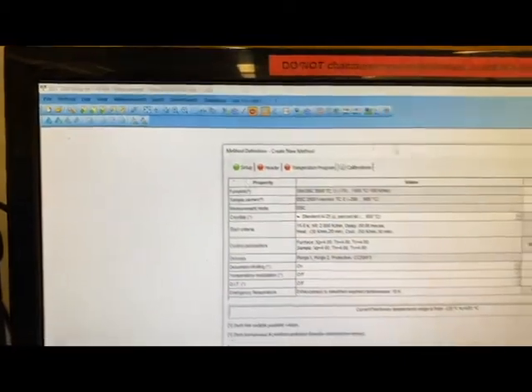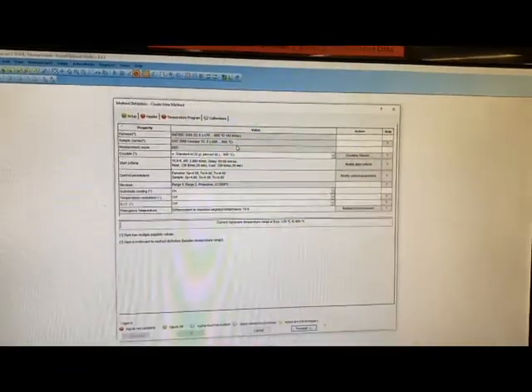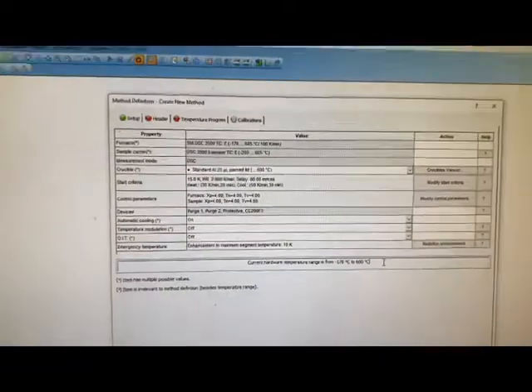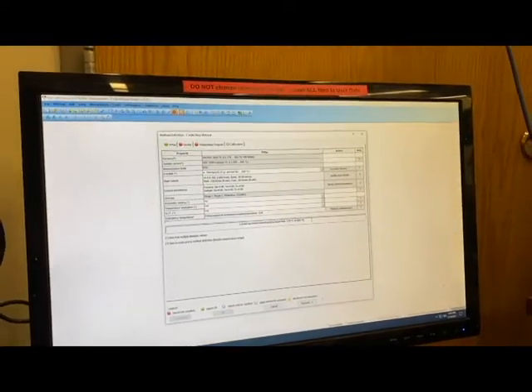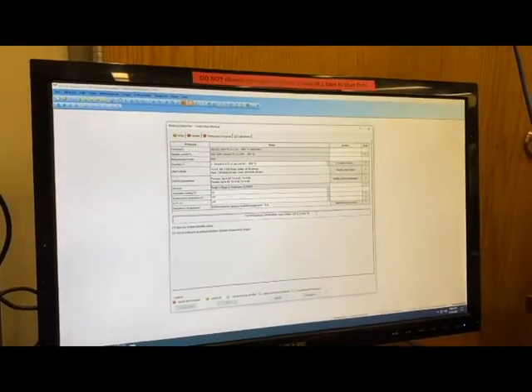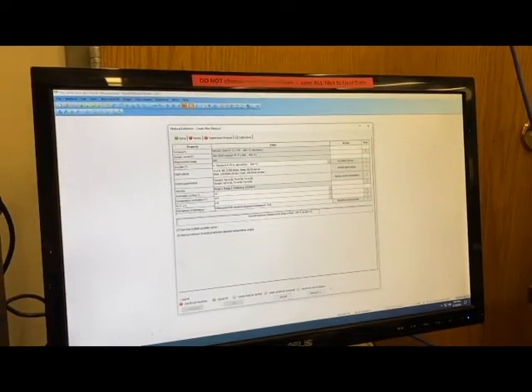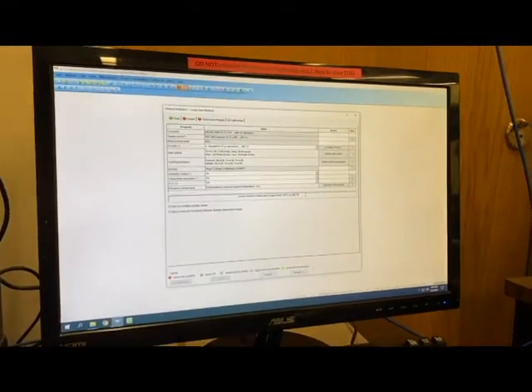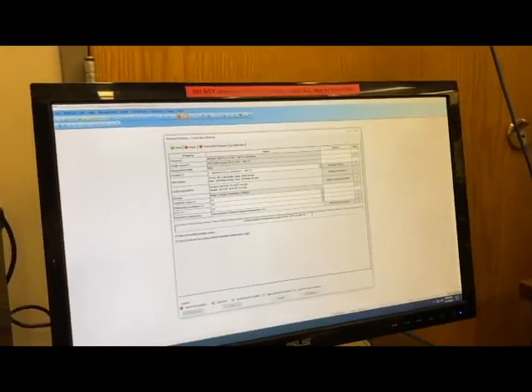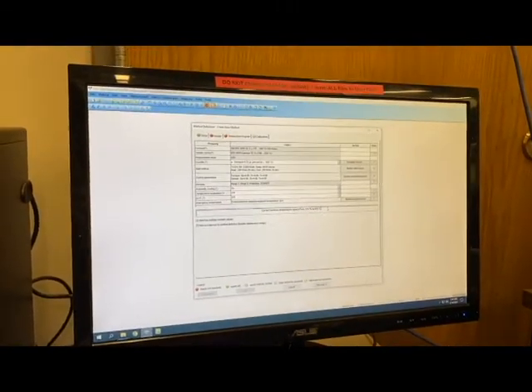The first thing we're going to do is create a method. To create a new method, click Method > Create New Method. This is the method dialog box. This first page just tells us about the hardware installed in the instrument. Our current temperature range is from negative 170 degrees Celsius up to 600 degrees Celsius. At the extremities we have some issues — it can't cool quite to negative 170 without working very hard, and running near 600 over time will wear out the furnace, so we tend to stop around 500 degrees Celsius. The functional range is more like negative 140 up to 500.